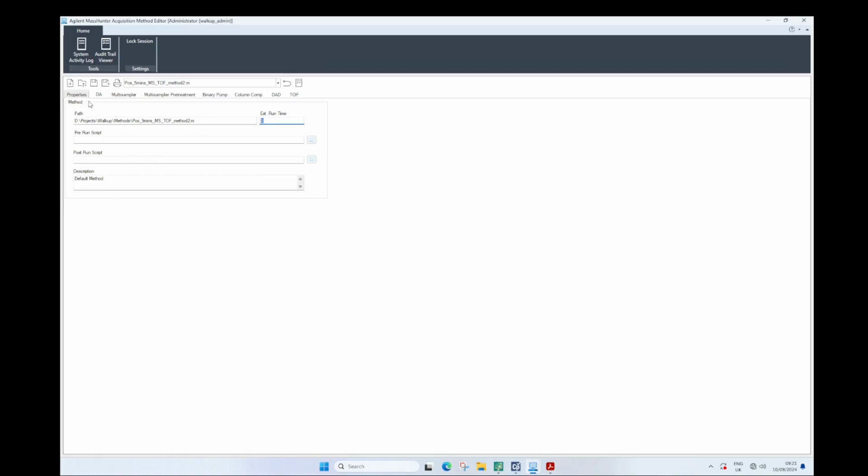So we don't change much in this tab. For data analysis, data conversion, we might have sure mass conversion on or not, depending on if you're doing screening for larger types of data files. In this case, it's not necessary. So no automations are running data analysis wise after acquisition. That's what you would set here.